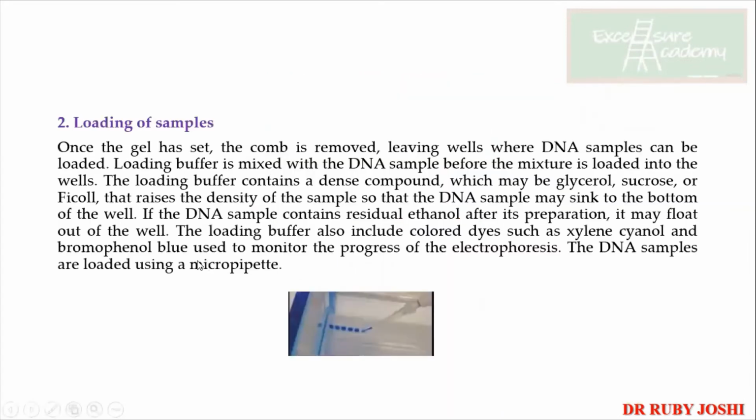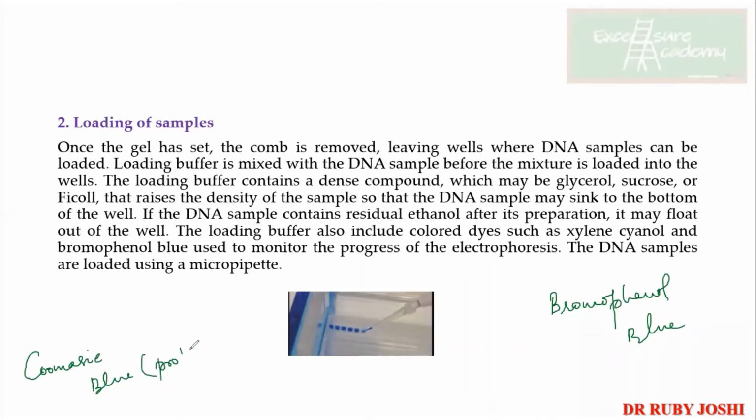Now loading of the sample. So you can see that the blue color tracking dye रहता है, bromophenol blue रहता है. Okay, please इसको भी याद कर लो. It is bromophenol blue. In the case of proteins, we use Coomassie blue. ये protein से किसने है? Okay. So those are also mixed with your DNA sample.